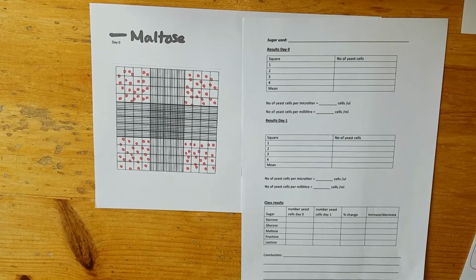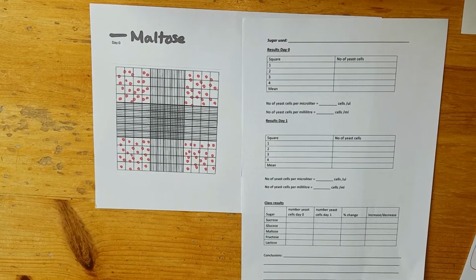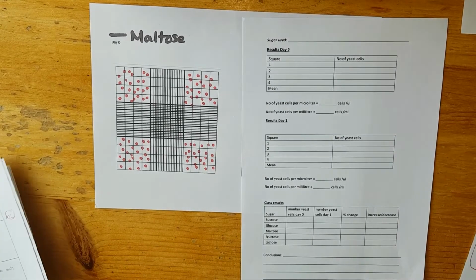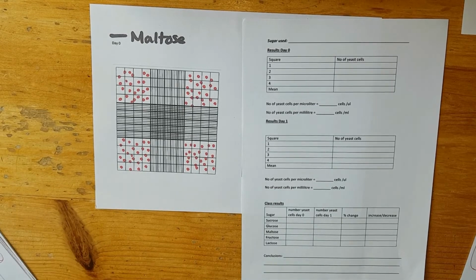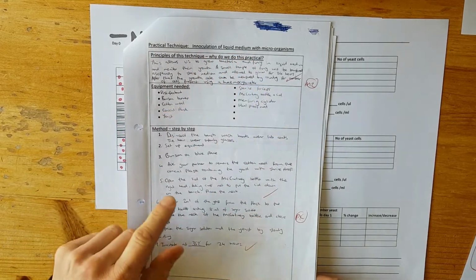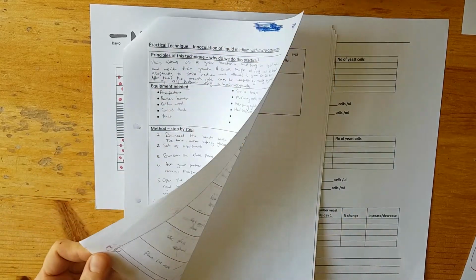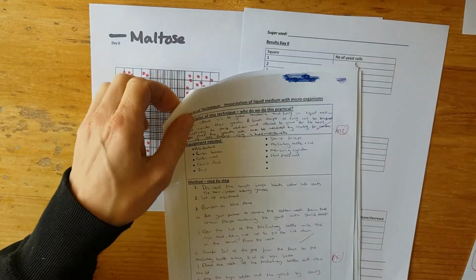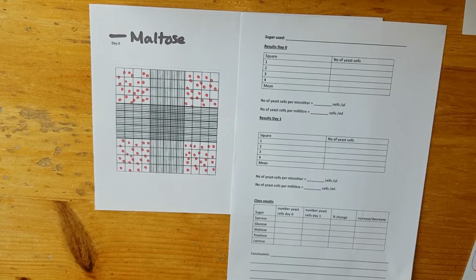So this is the pass and the merit for experiment 3, which is your hemocytometer experiment. You've set up the hemocytometers in class, and you've done the measurements with the yeast, and you've written up a sheet like this, inoculation of liquid medium with microorganisms, with the technique, the method, and so on. And you've also done the sterile technique. So you've done that already. So the pass is actually just collecting some results, and the merit is processing these results.